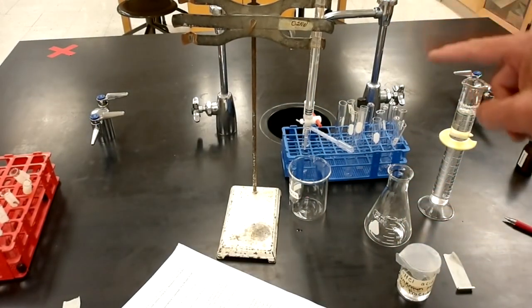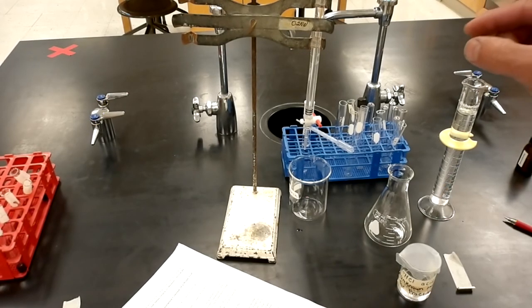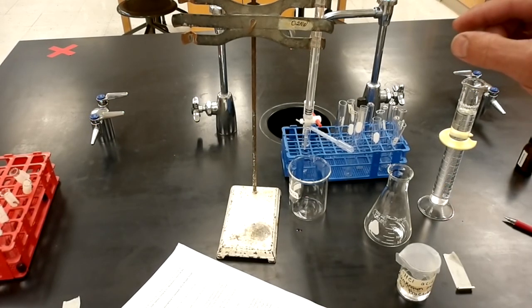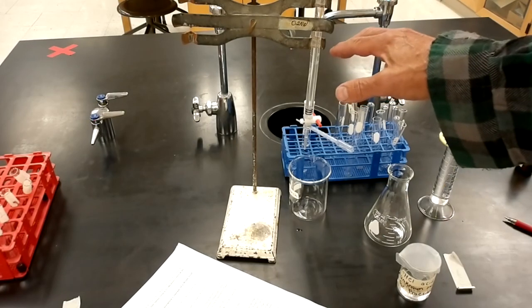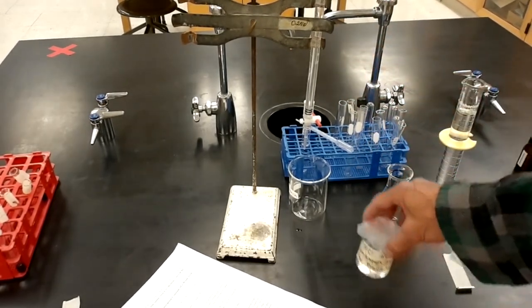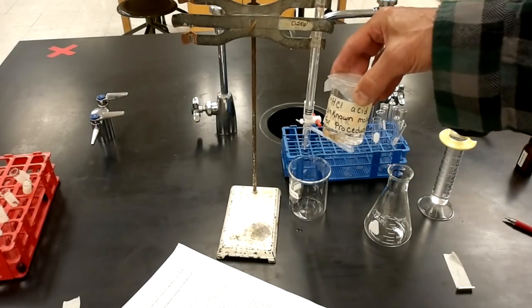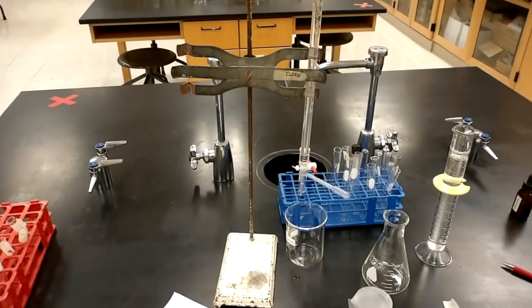If I add sodium hydroxide, which has a lot of hydroxide ions in it, the hydroxide ions will neutralize the acid, and I'm going to put in a color indicator that will tell me exactly when I reach a pH of 7. There will be a color change in the solution. When I hit that pH of 7, I know how much sodium hydroxide I added to get to that point, and I can calculate exactly how many hydrogen ions were in this unknown acid. So this is a really accurate procedure compared to all of the others.